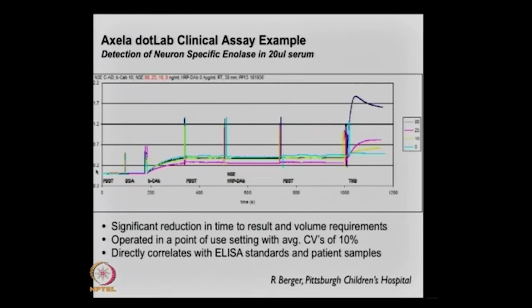So here's an example where it's effectively the same as we've been discussing before. You put down one protein that identifies another protein, and sure enough, it works. As a physical chemist, I feel like, if it works for one, it has to work for another. It's a question of how strong the signal is, which is dependent on how big the sample is. But the challenge here will be the level of the protein, right? In different patients. Yeah, what is a significant level?